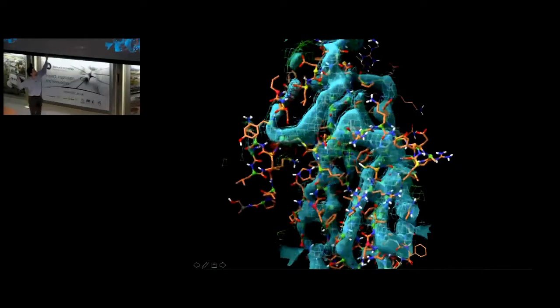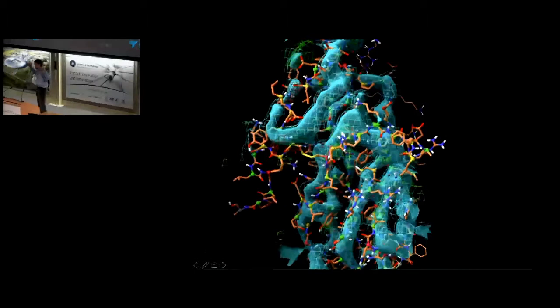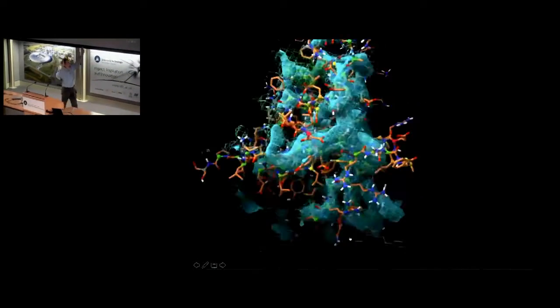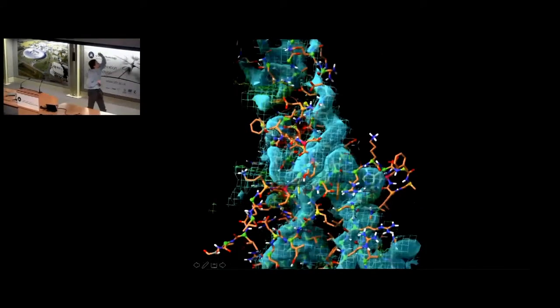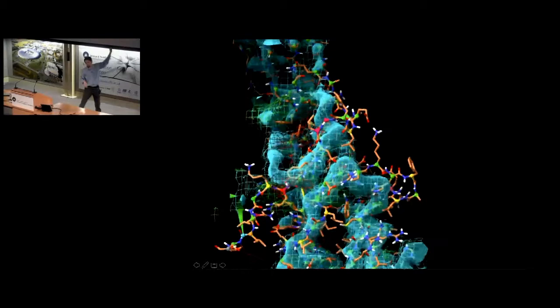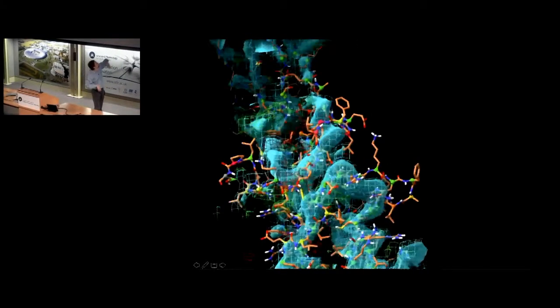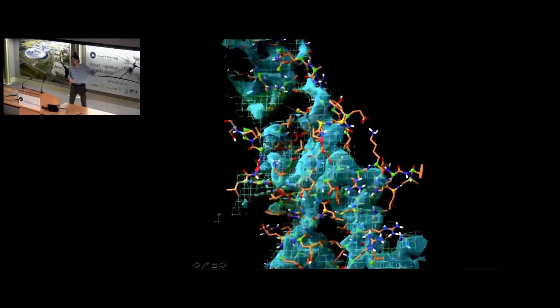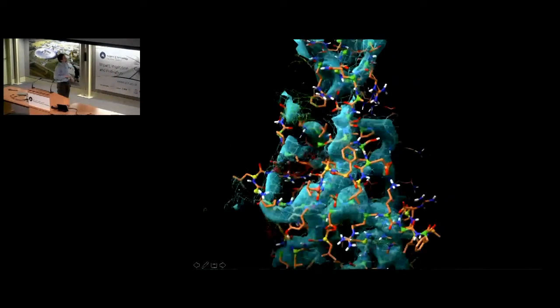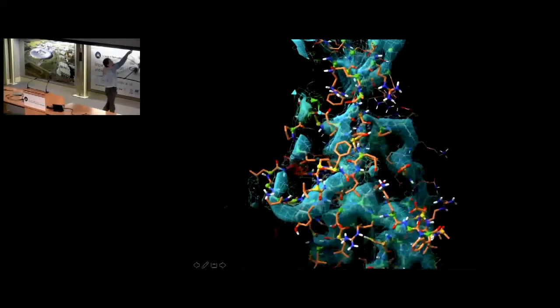So we're looking at this thing. We start our little local simulation. We have these all around it. We have a shell of atoms that are rigidly fixed in space, so that no matter what you do, it can't get out of contact with its surroundings. All these atoms are being pulled into this map. That little green cone is my haptic device. I just grab atoms, pull them, and they're constantly trying to fit themselves back into this map as I go.